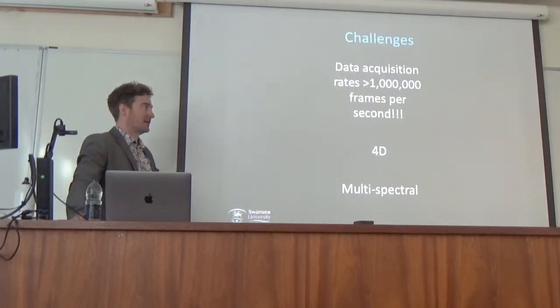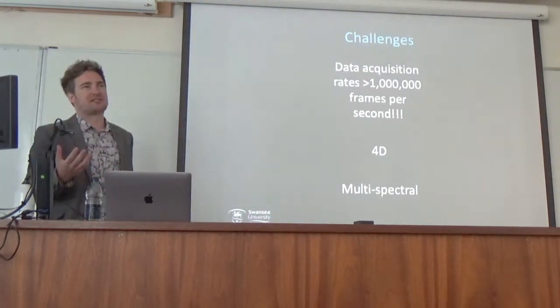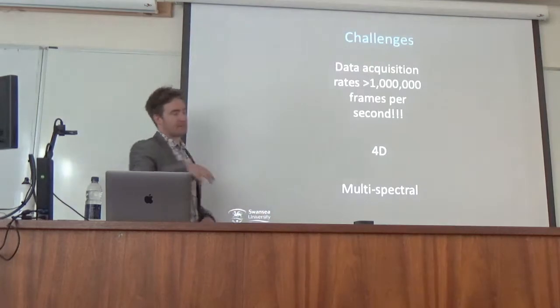Yeah, I don't know how you deal with that. And it's usually based around 4D. So you have 3D imaging, and then you do something. The reason you want to gather so many images is because something's changing. So that's compression of material, flow through it, or temperature changes.